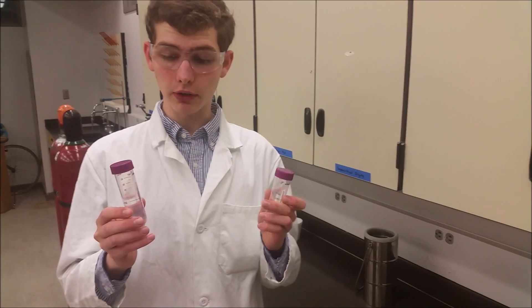But before you can get air inside the pores, you need to have a liquid as the precursor. So the way that you do that is you use two chemicals.